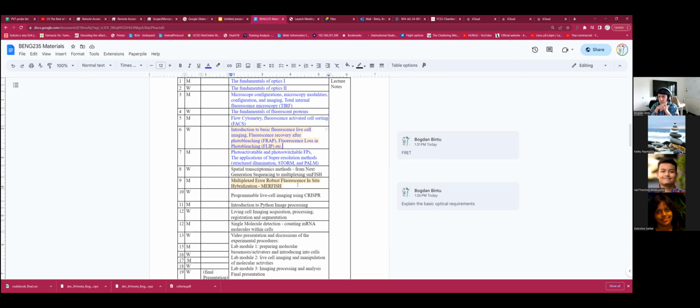Could you explain what you mean by spatial distribution of organization of cells? I'm new to this field, so I've never done fluorescence microscopy in my life. I was just wondering, are you looking at the organelles, or are you looking at how two molecules are interacting within the cell? What does that mean?